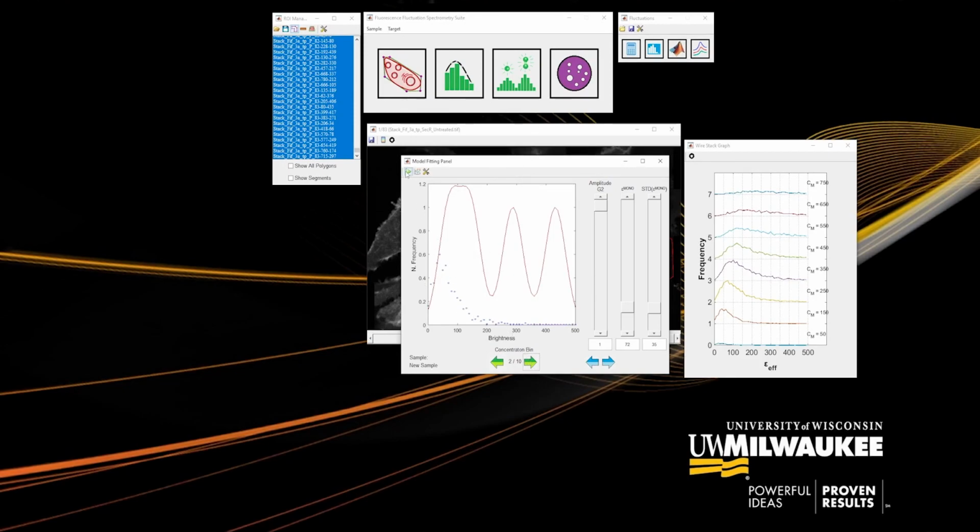To fit this spectrogram, we are simply going to use the Autofit feature. You should be able to see that on the first click, the graph snapped to the data but adjusted itself with subsequent clicks. Specifically, a small hump showed up near the middle of the graph after multiple clicks. Now we're going to go through the rest of the spectrograms and fit them using the Autofit feature. Confirm that all spectrograms are fit to your satisfaction by navigating the spectrograms using the green arrow buttons.